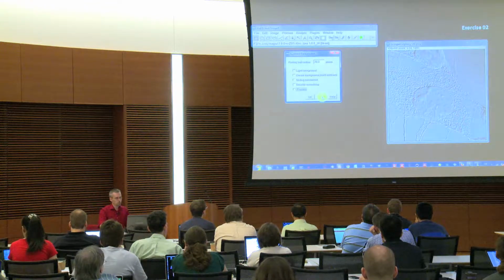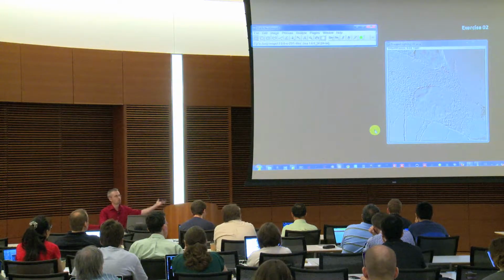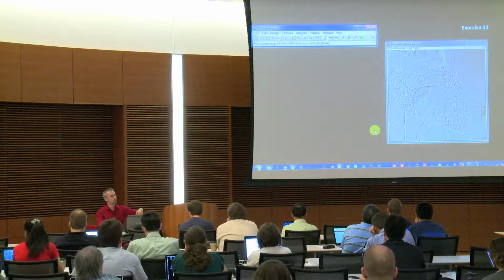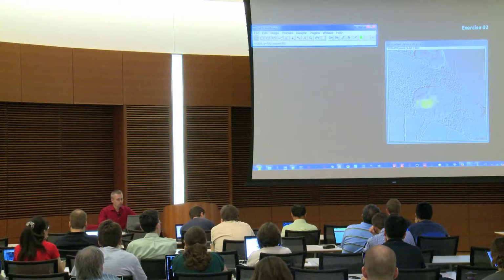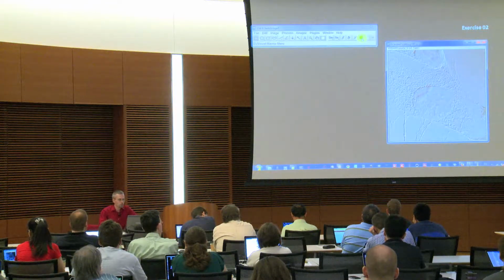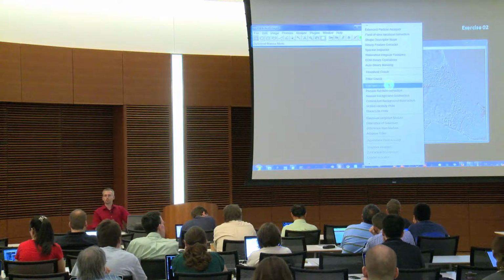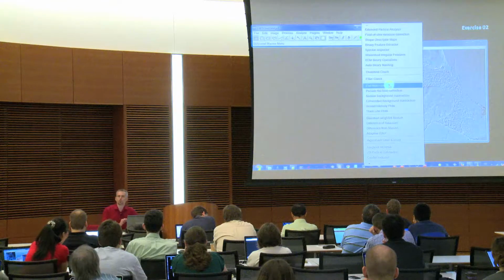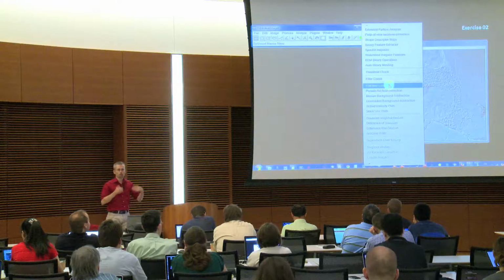My problem is actually rather that I have this unequal lighting. So subtract background is nice for fluorescent images or anything which gives you a bright signal on a dark or black background. Here we would use the other option. Under the green cube, you will find two possibilities. Flat field correction means you have a background image, which you can use to simply divide the original by.